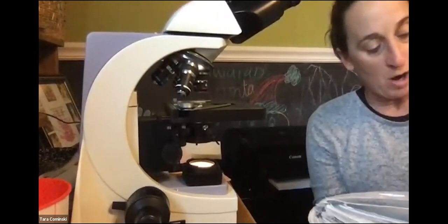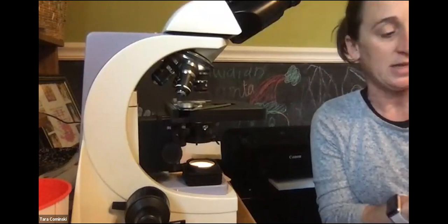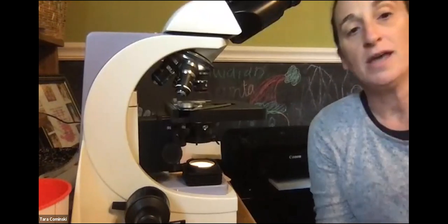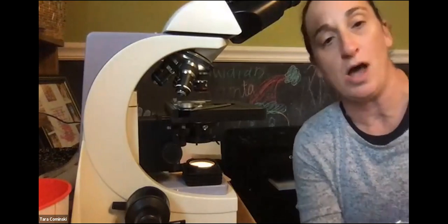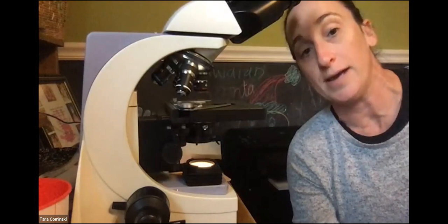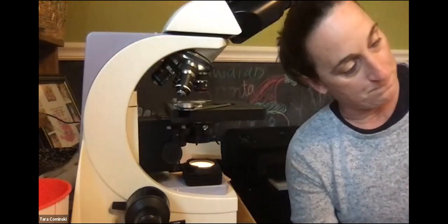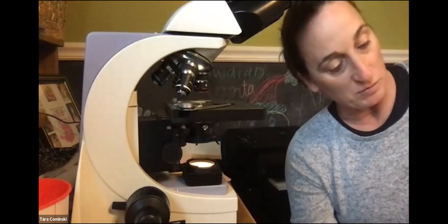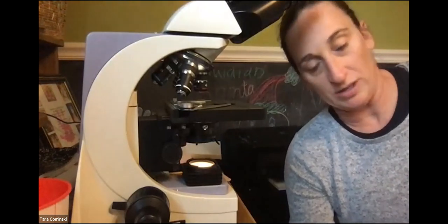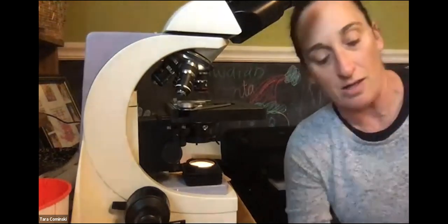Now, the next part on the bottom of page 20 describes how you focus in the microscope, okay? Then you're going to go through a couple of exercises about inversion using the letter E. We're going to skip over the field of view, but we're also going to look at depth of field using a slide that has 3 different strings on it, colored threads.